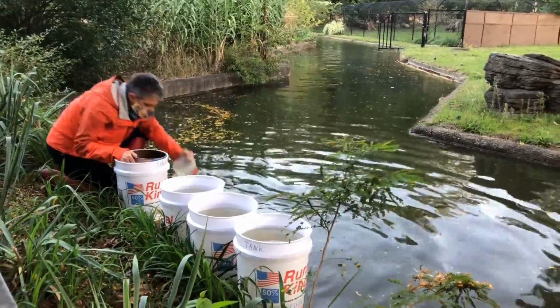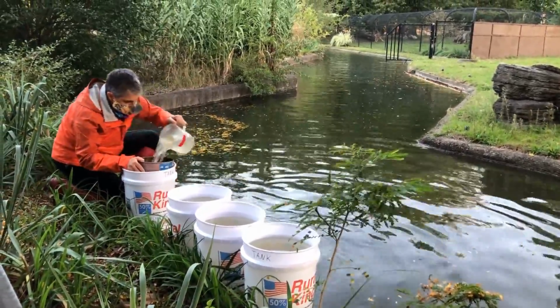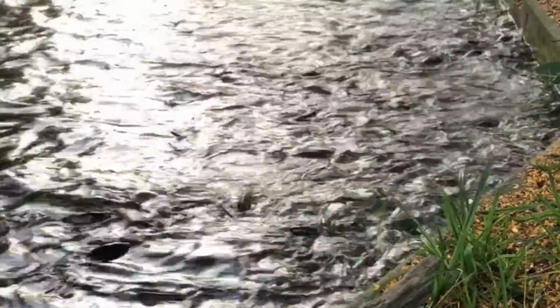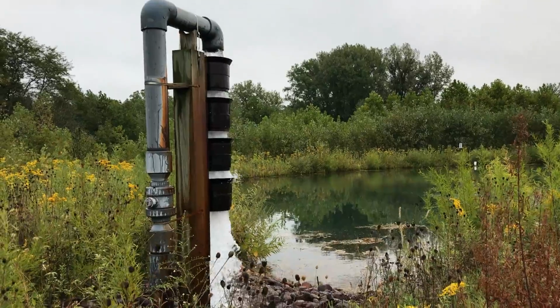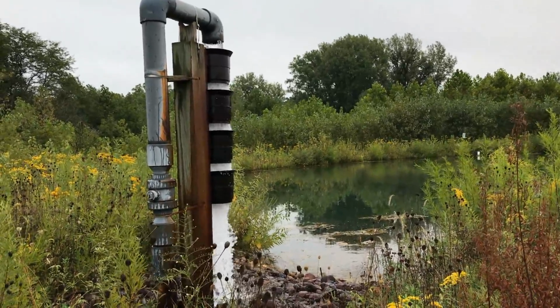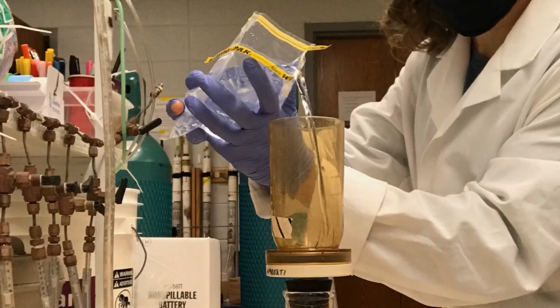Rather than adding fish directly to the LEAF streams, we collected eDNA in the form of fishy water from the Potawatomi Zoo. To do this, we simply scooped buckets of water from their moat where they house a large population of common carp. Then we mixed it thoroughly while using a pump to slowly and steadily drip the water into the stream. Since the LEAF streams are fed with fishless groundwater, we know that our stream started out free of carp eDNA. After we sampled throughout the streams, we took the water samples back to the lab and filtered them so that we could extract and quantify the eDNA in each sample.